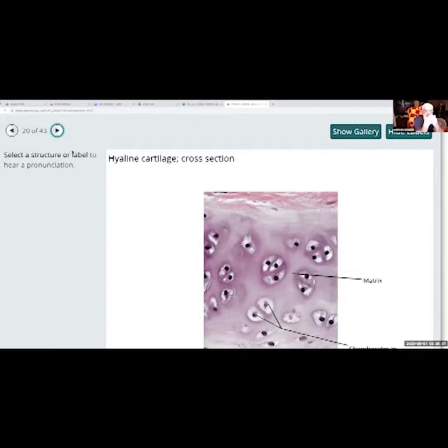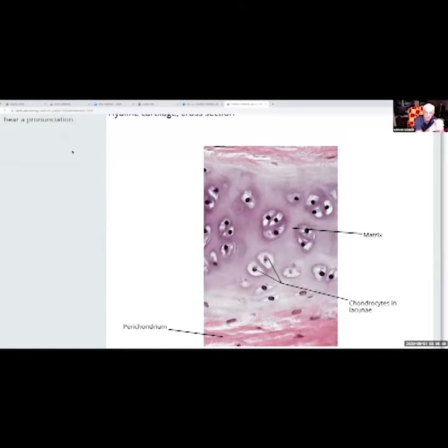Okay. Magnified view. Again, you can definitely see... Oh, where was it? Back here. There it is. You can definitely see the lacunae in there.